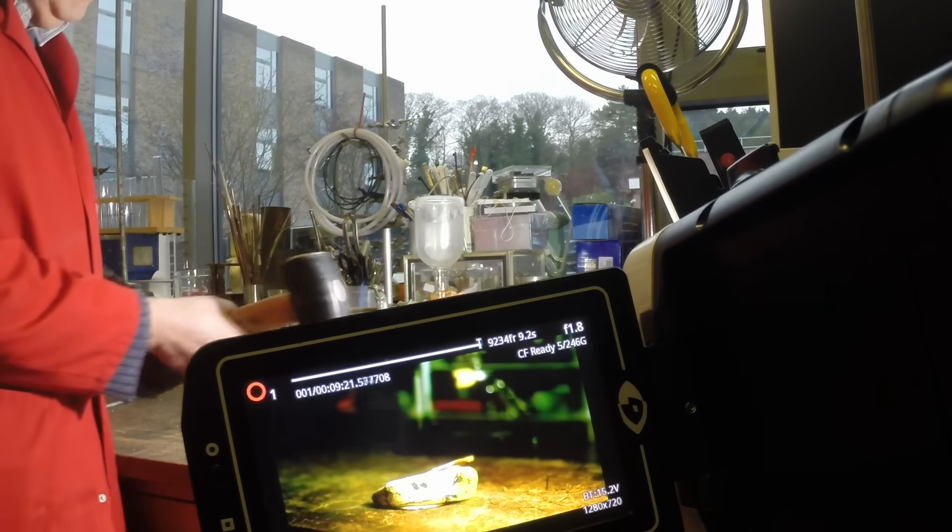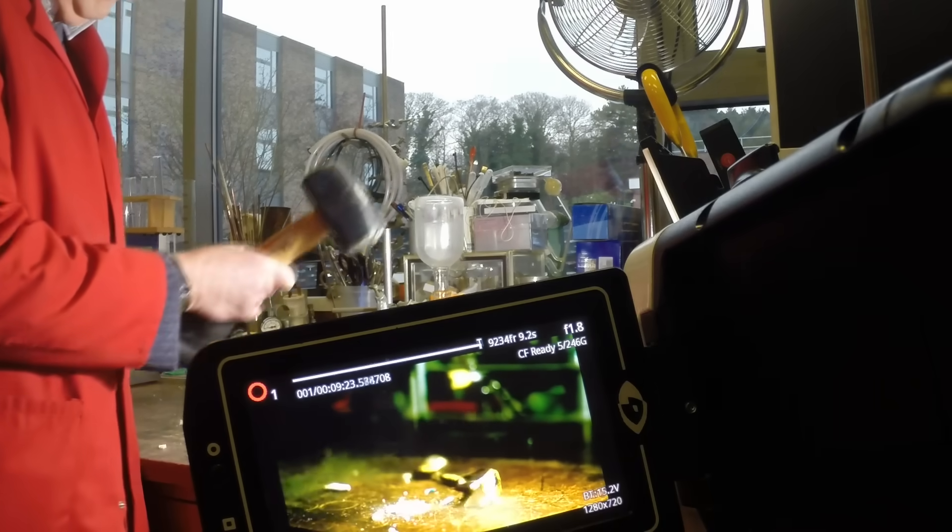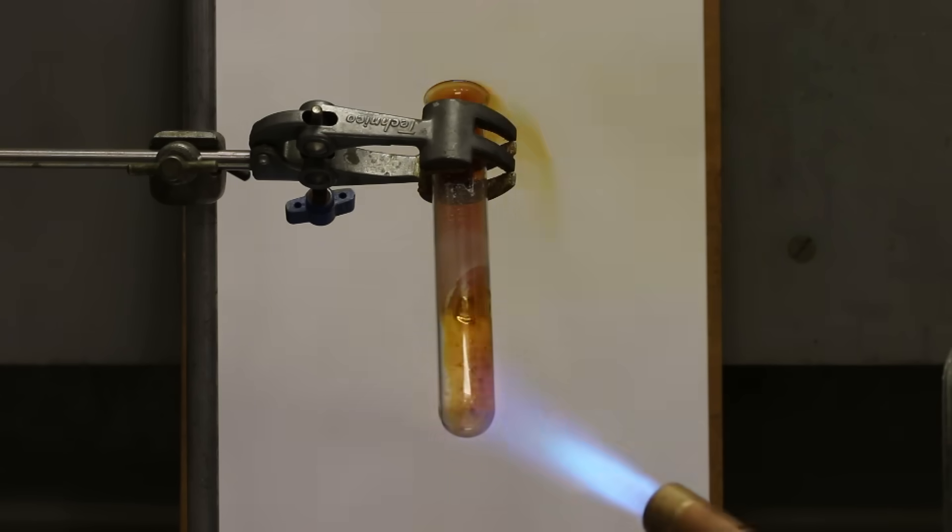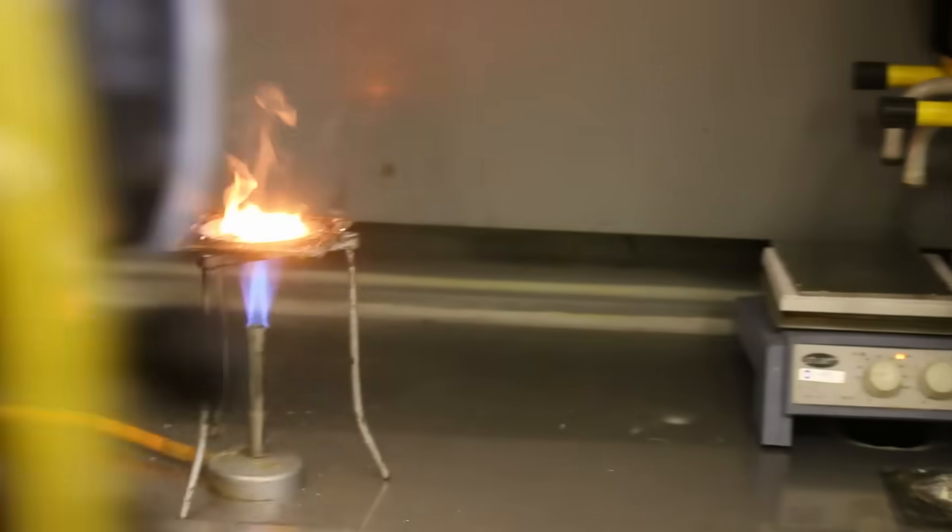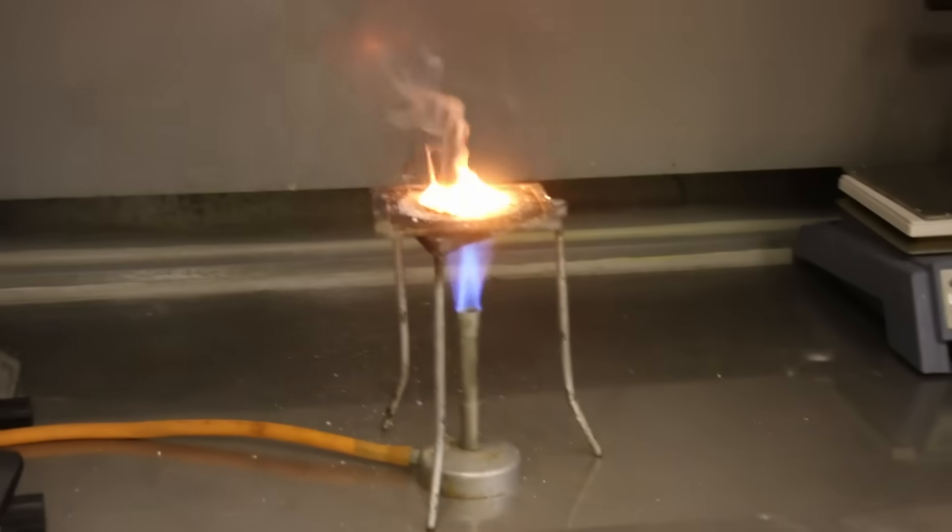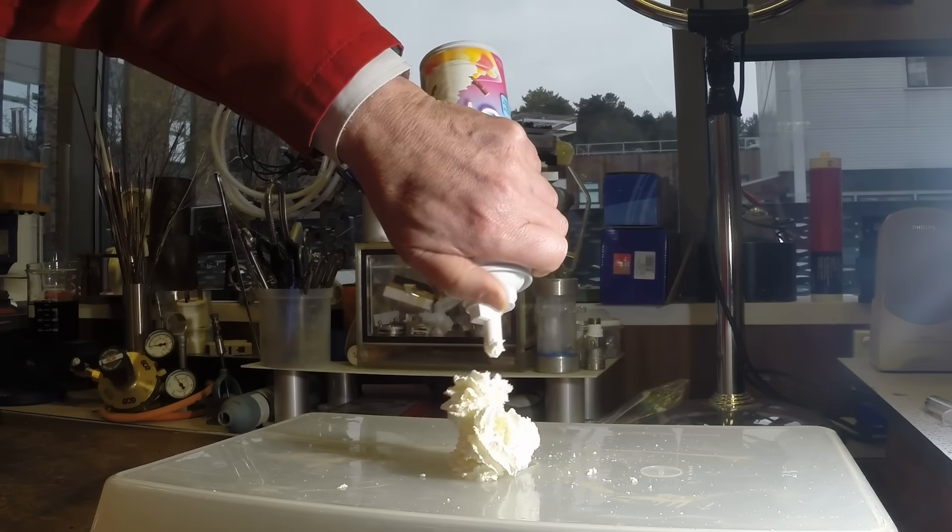So you'll see me trying to smash a banana, you'll see brown gases being generated, sodium azide going off in quite a spectacular manner, and one or two other things. So it's really fun, but there is some quite solid chemistry behind it.